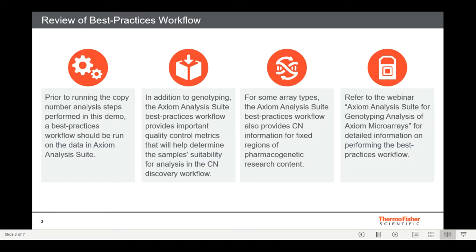While the tutorial in this webinar will focus on copy number, I'd like to first review what we call the best practices workflow in Axiom Analysis Suite. For all Axiom Array types, the best practices workflow performs sample QC and genotyping. Since we want to include high-quality samples in our later copy number discovery workflow, the sample QC metrics resulting from the best practices workflow are important to evaluate and will help us decide whether a certain sample should be excluded from copy number analysis. Therefore, it's recommended to run the best practices workflow on your samples prior to running the copy number discovery workflow.